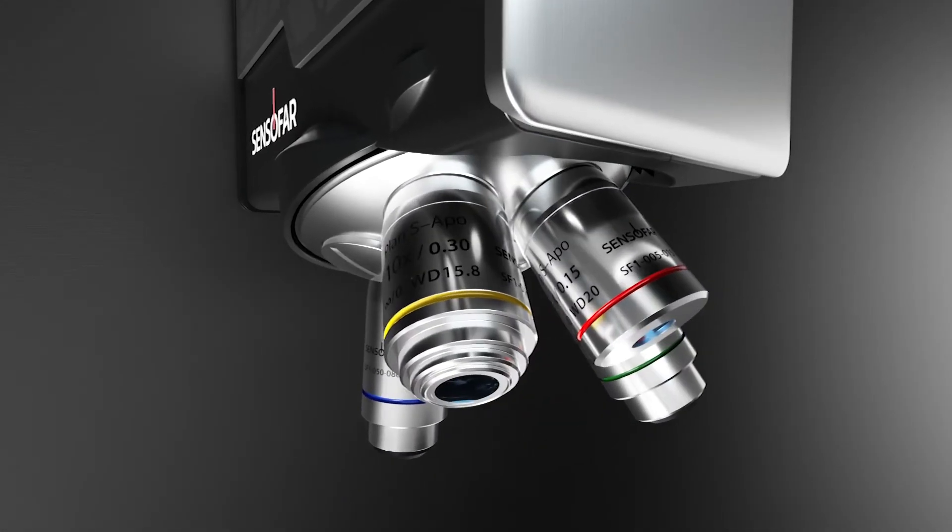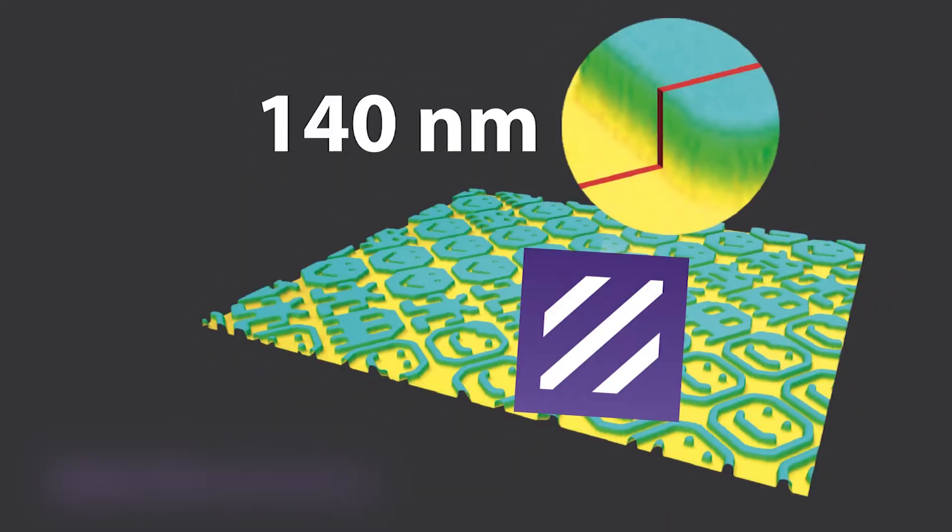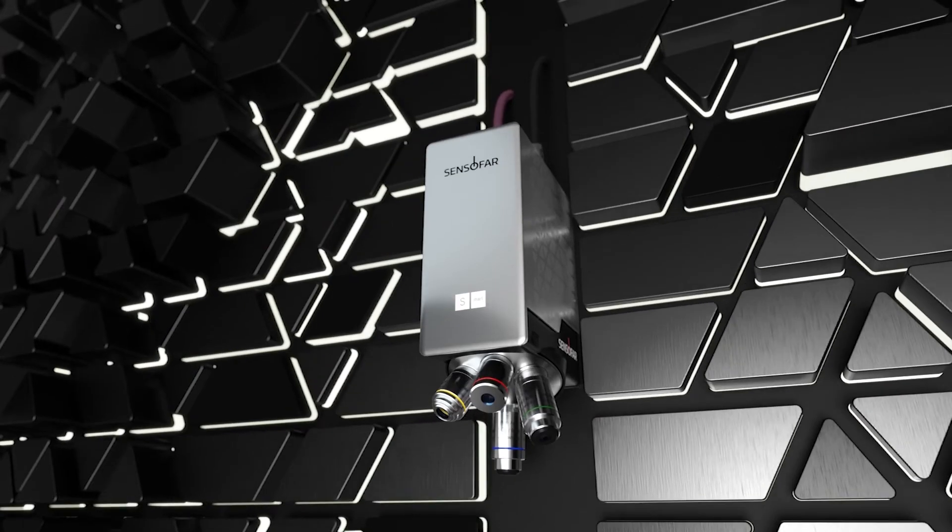A six-position nosepiece and three different technologies constitute the versatility that empowers the user to measure any sample with the most suitable technology for each application.